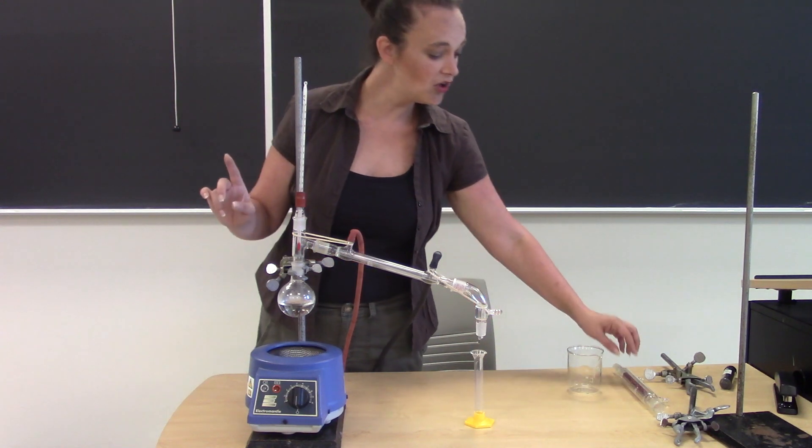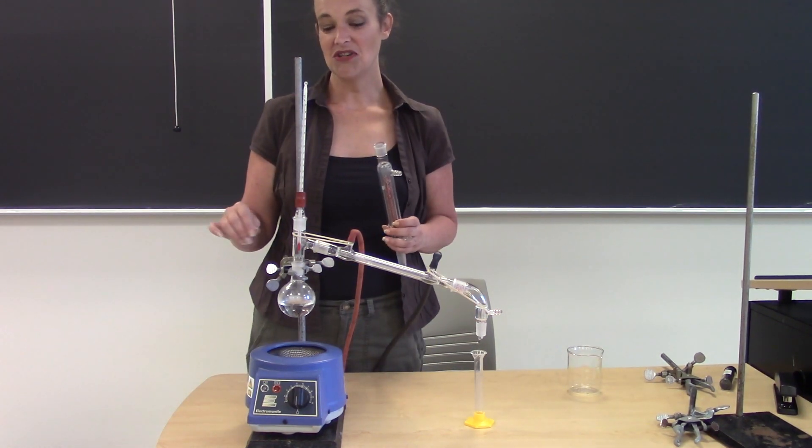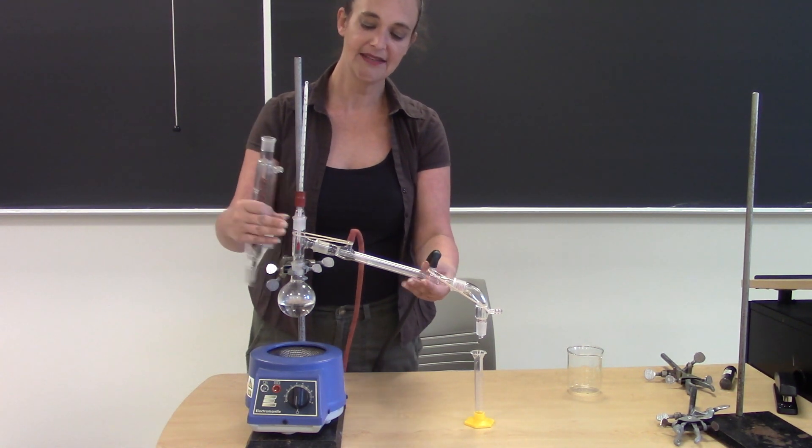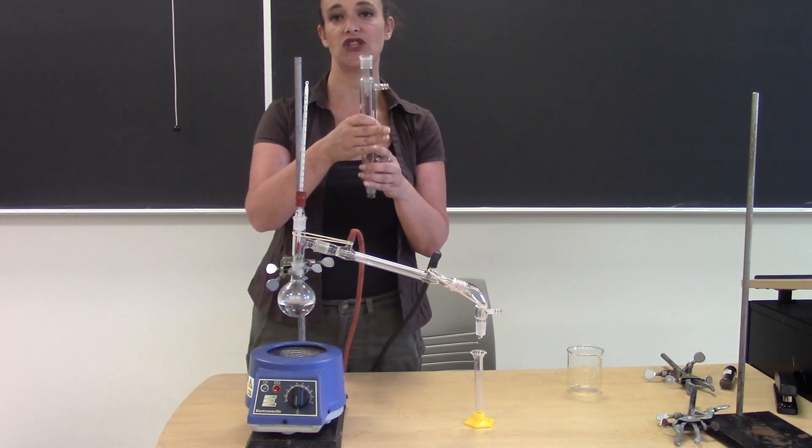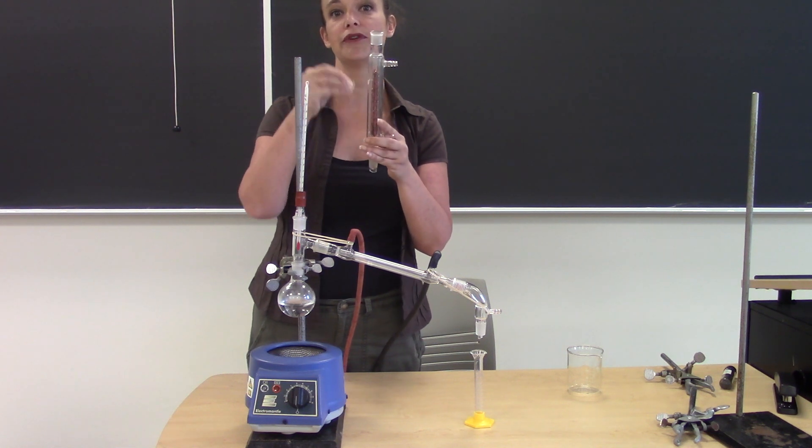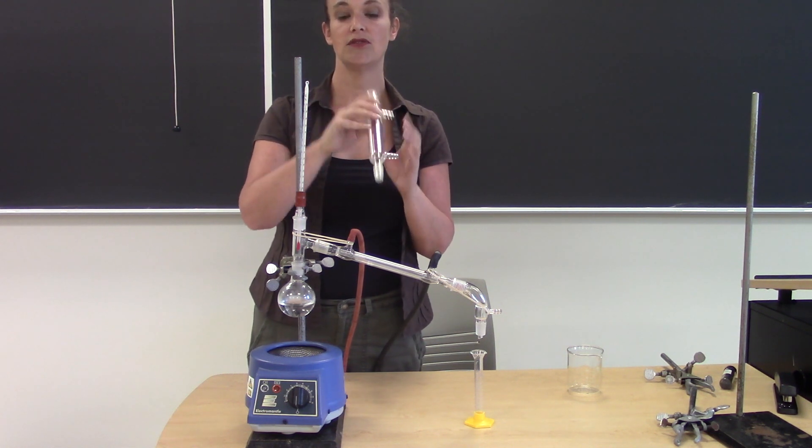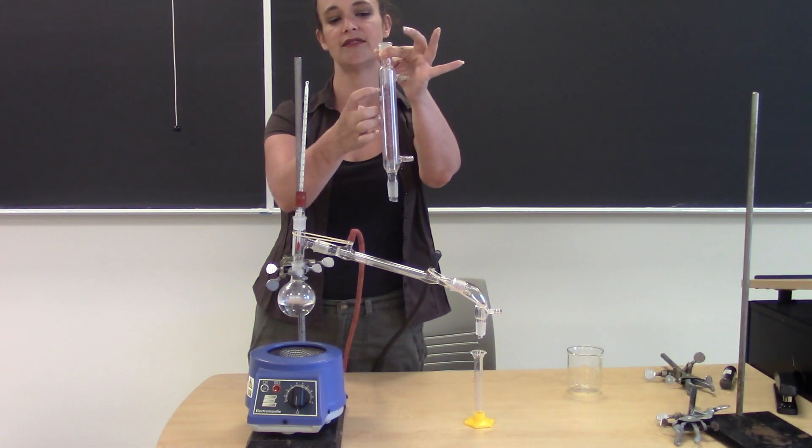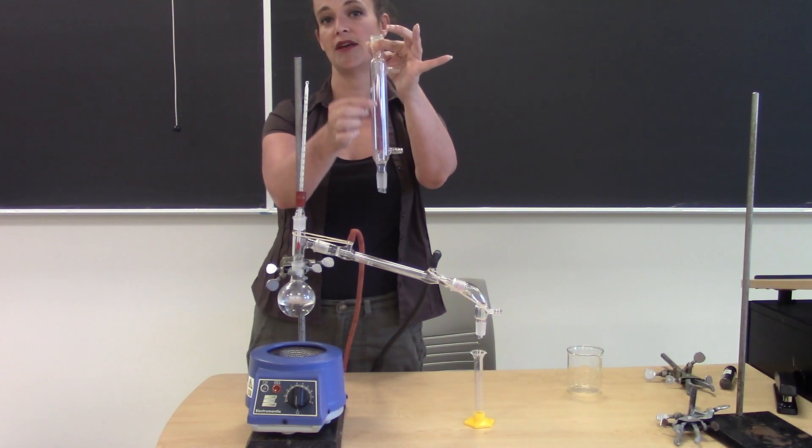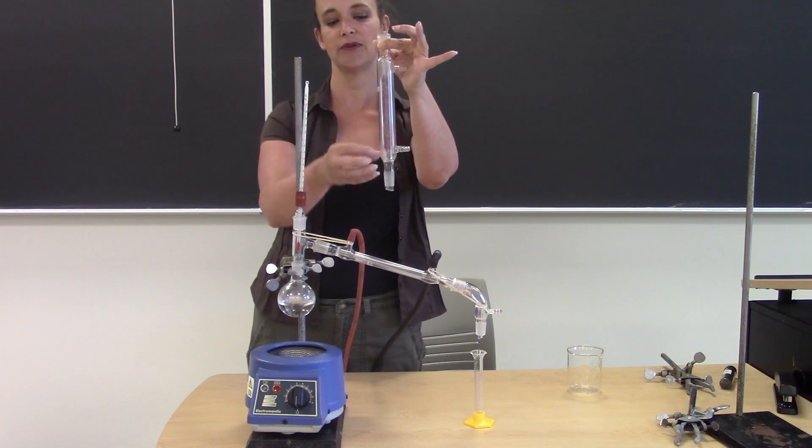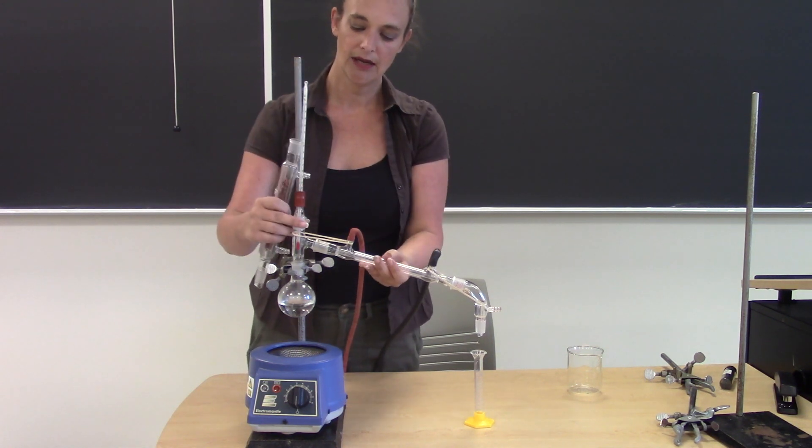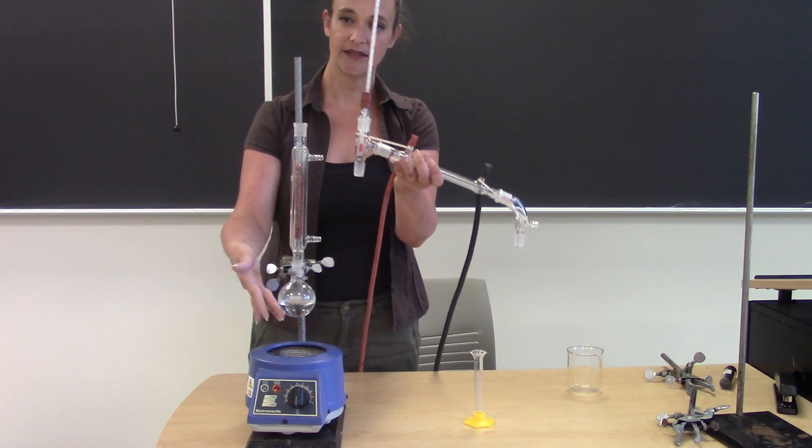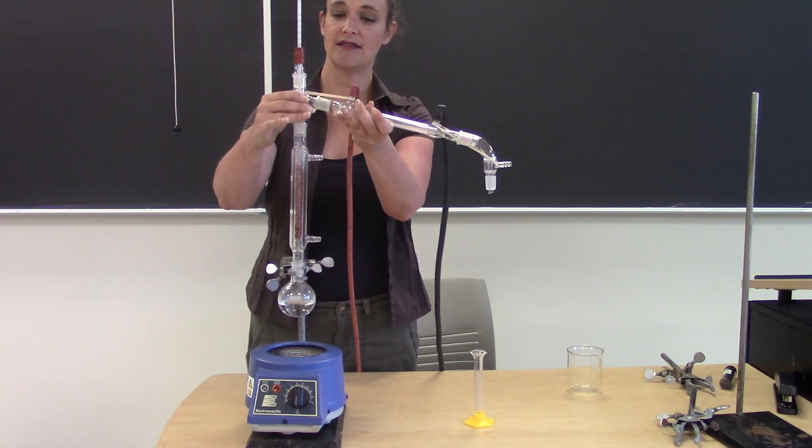We can also modify this to do what is called a fractional distillation. Now a fractional distillation takes a simple distillation and has it repeat itself over and over and over again. And so what we're going to do is put this column, which has some copper mesh embedded inside where the vapor is going to flow. We are going to put that in between the distilling flask and the distillation adapter.